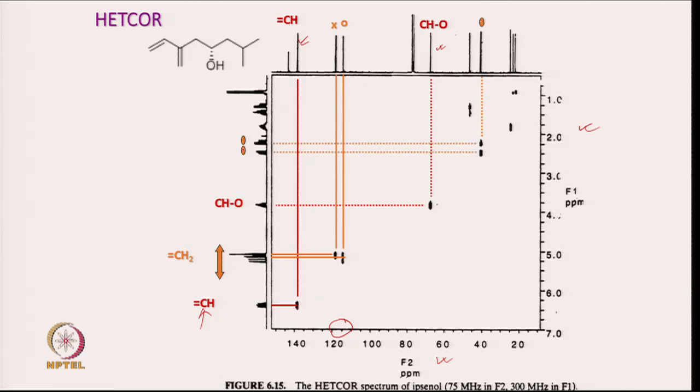These 2 protons are correlated to this carbon, which comes at 40 ppm, and again this proton is correlated to these carbons, which come around 30 ppm.